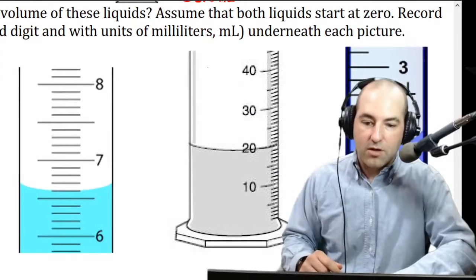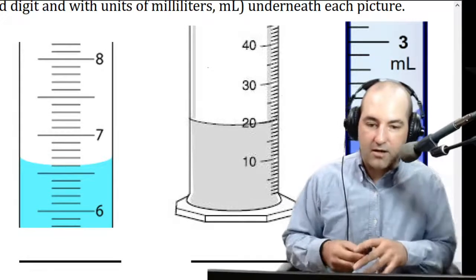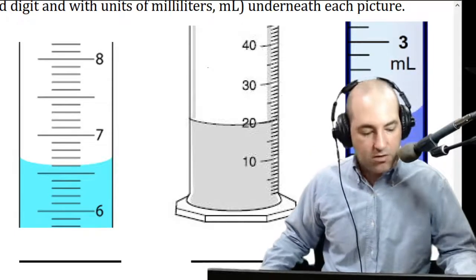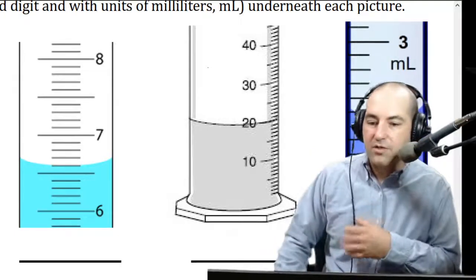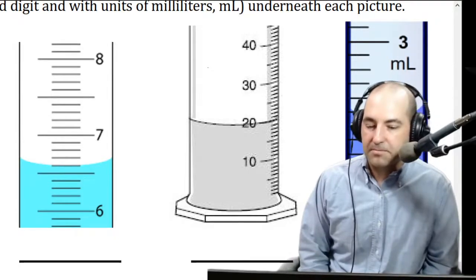Okay, so then to practice this, give these three a try. And you can leave them in the chat or on paper, but see if you can write a measurement for each of these three graduated cylinders.